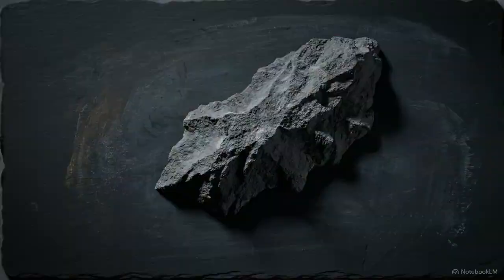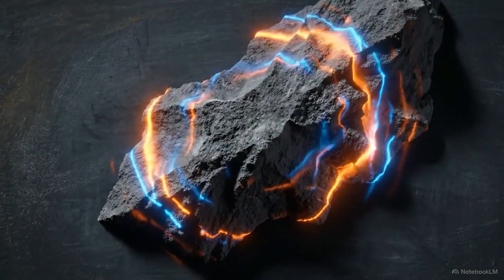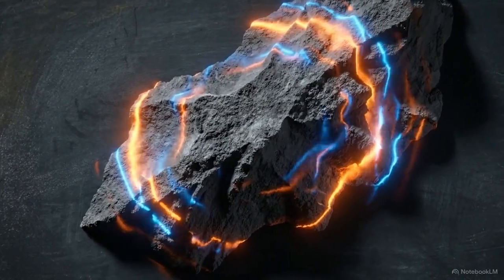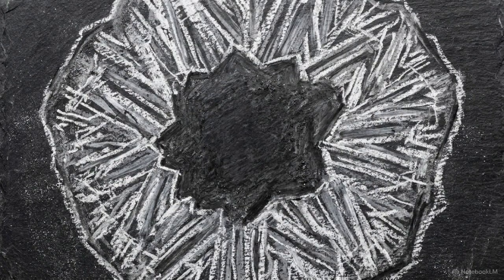It parses an entire spectrum of physical and chemical data from a single nanometer of rock by tracking how energy decays. We calculate picometer wavelengths and track probability scatterings because macroscopic planetary events are encoded at this microscopic scale. Consider a garnet crystal exhibiting symplectitic decomposition, where its irregular edges break down into an intergrowth of orthopyroxene and plagioclase.